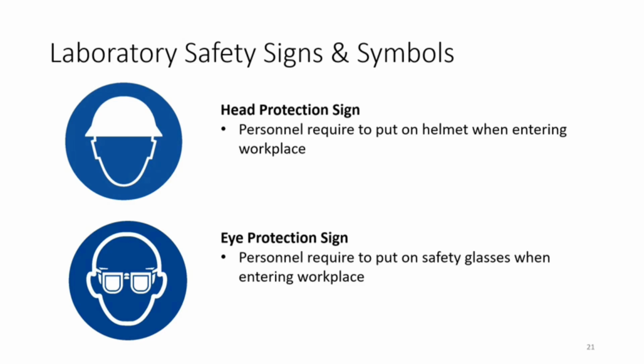Eye protection sign. The personnel is required to put on safety glasses when entering the workplace. In our lab, we actually don't really see this eye protection sign, but by default, if you're working with chemicals, you should be wearing goggles all the time.